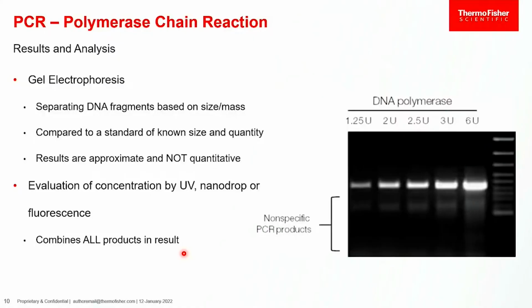There's also variation in the melting temperature that we choose. If things are too similar, you can make a little bit of something else. So we have to be really careful when we go through this design process and developing an experiment. A lot of people talk about, oh, I just throw in some primers and it works great. But if we actually do this well, there's a validation that happens up front that makes sure we only made one thing, and we made exactly what we wanted to.